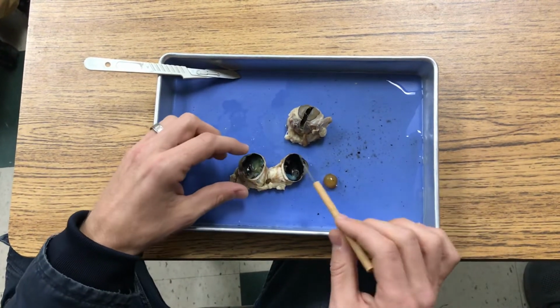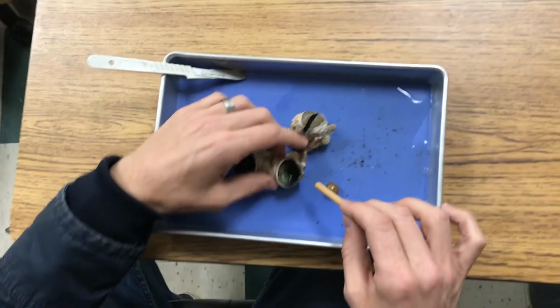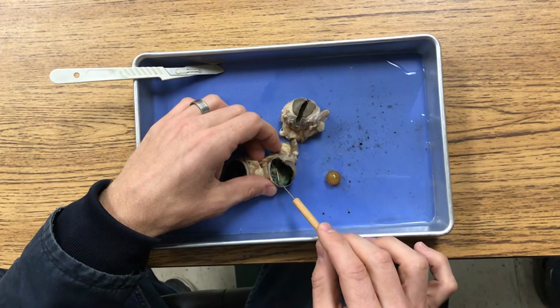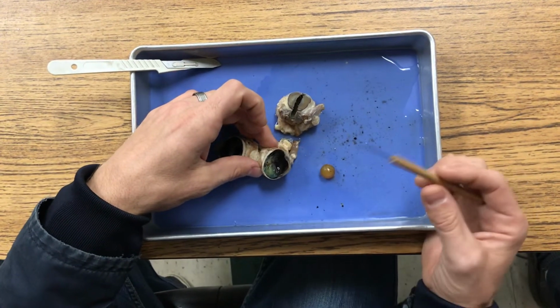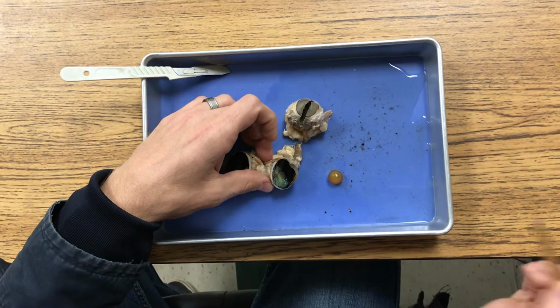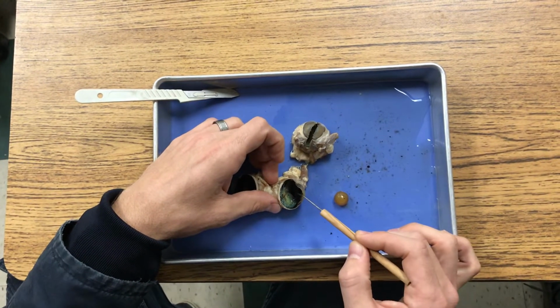Okay. We then have 3 layers on the back of the eye, well, surrounding the inside of the eye. And this is the retina layer. So this has all the neurons in it. And then this is a sheep. It actually has an extra layer. So it has this shiny layer called the Tapetum Lucidum, which you don't have to know. But this helps reflect light as it goes in, especially at night.